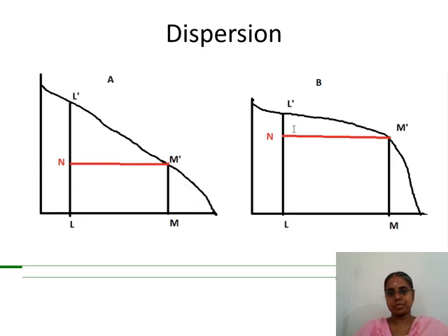Whereas when you have this B type of fiber, almost all these fibers are under control and only fewer short fibers, or fewer floating fibers, will be there, because short fibers you can remove in the comber. Here, even if you have L dash, I think almost 50 percent will be floating fibers. Here there will be no floating fibers, so unevenness will be very less. So it is better to choose B for having a uniform yarn.